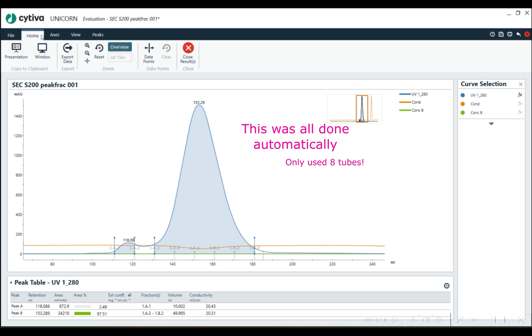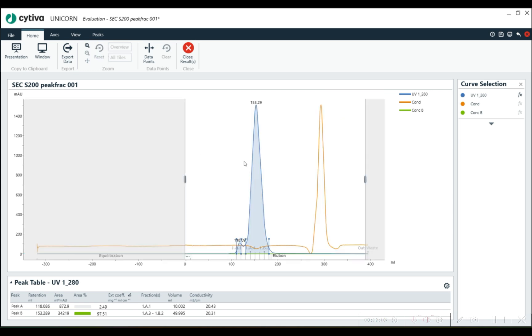It's expensive to collect a ton of fractions every time. It's also annoying. It's a lot of work taking these fractions in and out of the fraction collector, but it also allows us to do a lot of runs all at once. So if we have to do 15 SEC runs, it allows us to put all those runs in just a few racks in the fraction collector.